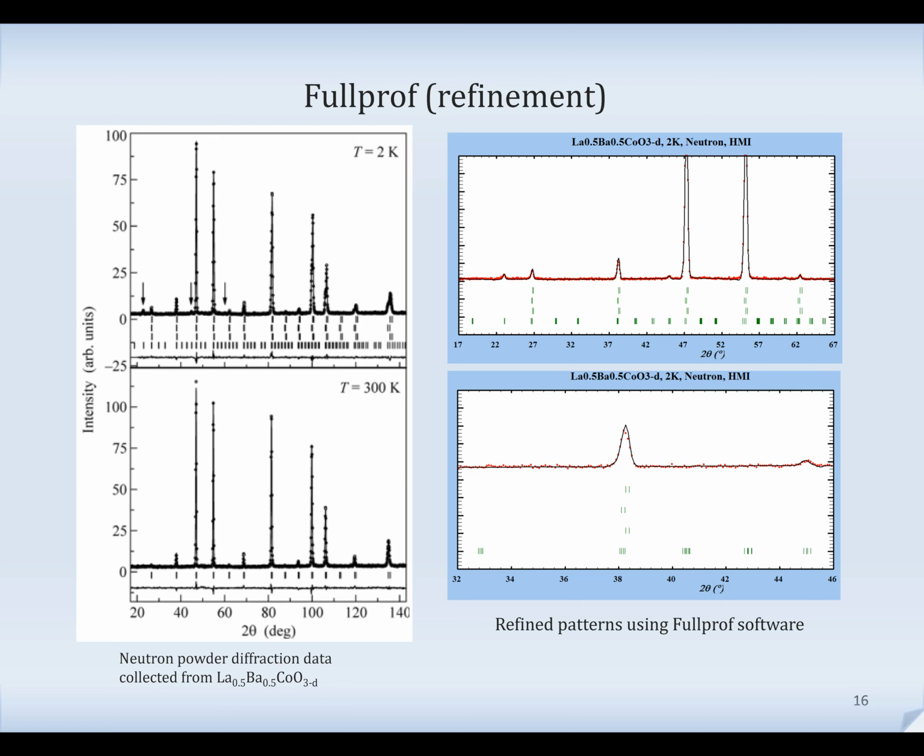So it's really interesting to combine different techniques, to show the advantages of different techniques. With neutrons, we can read magnetic scattering, the magnetic contribution, and with synchrotron, we get the best resolution we can reach. So in reality, it's split.